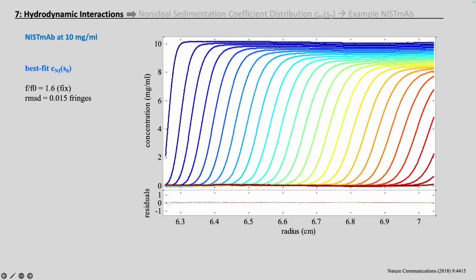This provides us with estimates for ks and kD, from which we can calculate a second virial coefficient. We can corroborate the ks value, which compares favorably to the value from an entire concentration series, and we found the virial coefficient is very nicely consistent with what we measure independently in a sedimentation equilibrium experiment.